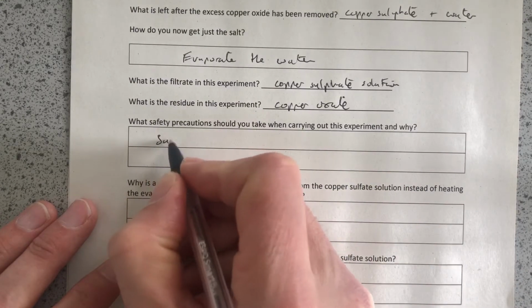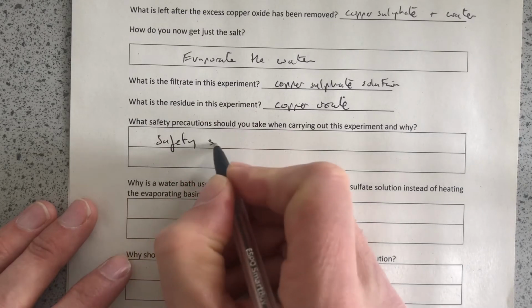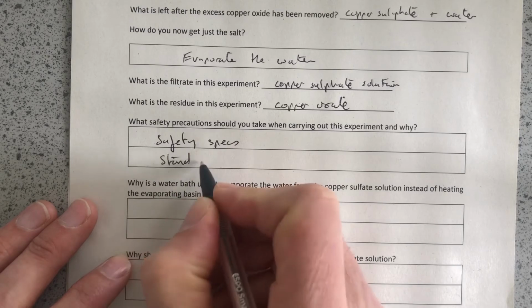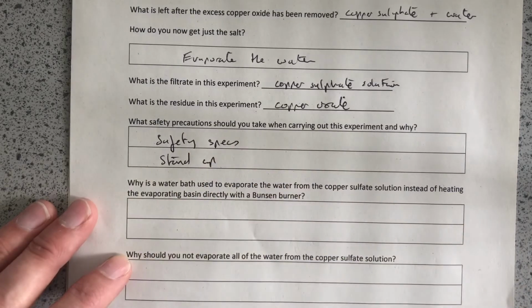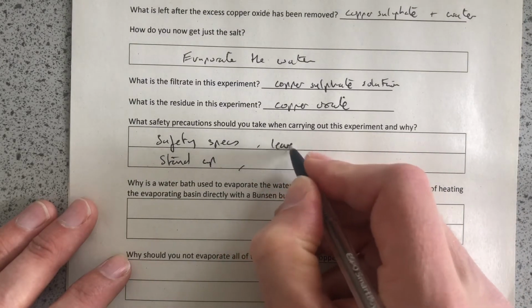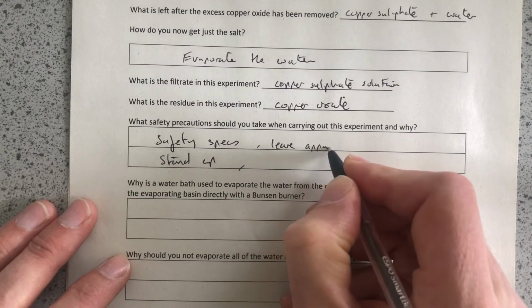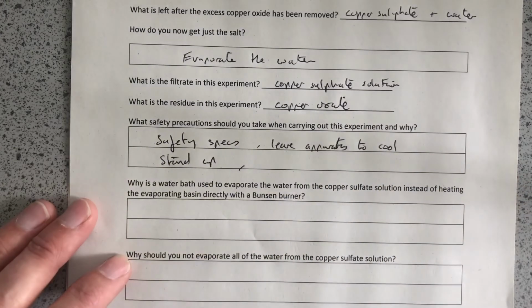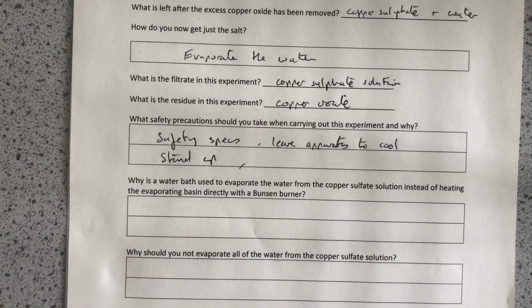Well, safety specs, absolutely essential. Stand up, because we don't want to get burnt either, and if something tips over it might go on our lap. And leave apparatus to cool. That's important. So after that evaporation, it's all going to be very, very warm indeed.